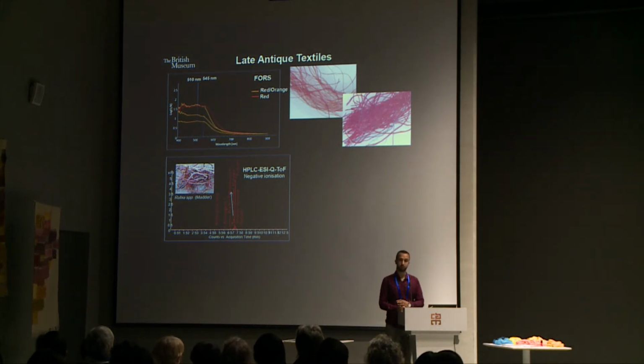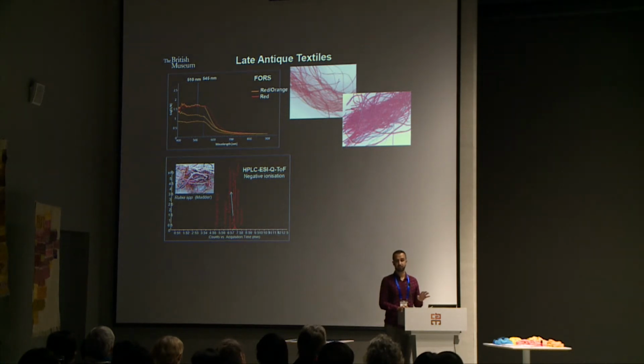It's always difficult to say the exact Rubia species of the madder when you are in front of very old samples. But the interesting thing here was that the two samples didn't show enough difference to justify such a difference in color based on a different source of madder.